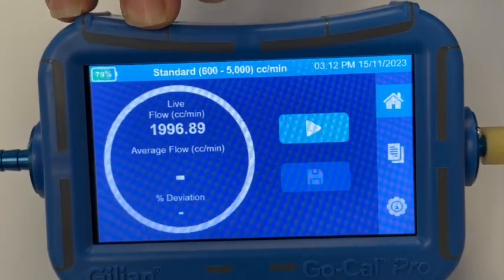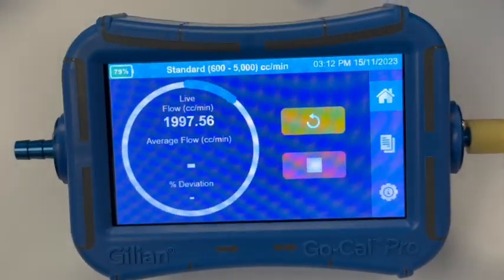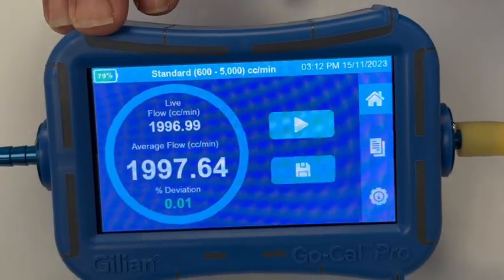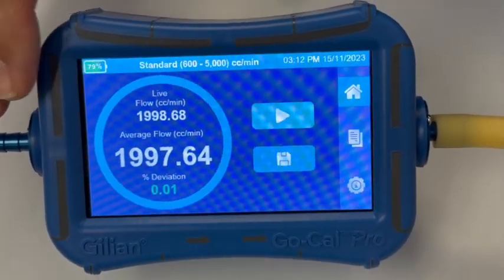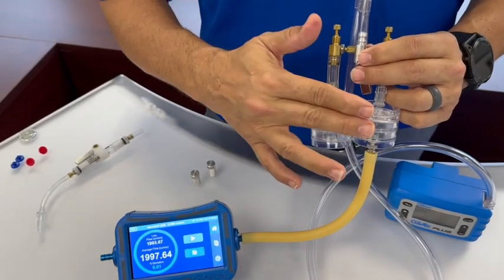Once you achieve a stable reading close to your desired flow rate, we can verify it using our Go-Cal Pro by hitting the play button. This takes an average of a five-second sample range — showing here at 1,997, which is well within one percent of our target 2,000 flow rate.